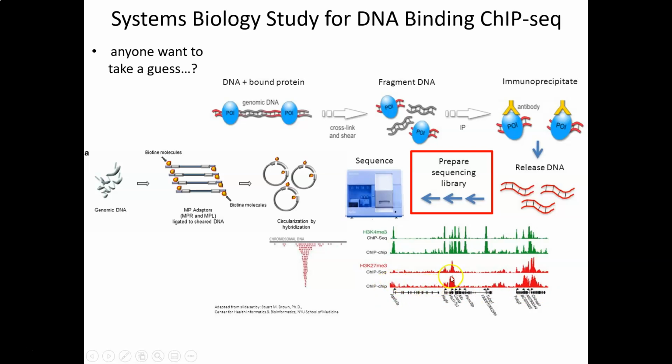And the size of these peaks represents how many of this same identical sequence we picked up in our sequencing reaction. That is indicative of lots and lots of protein binding with high efficiency. All of these shallow peaks here represent regions that our protein was bound to, but not at such a high level. So we see that our protein is bound in some intermediate way here at the end of the chromosome. It's really down to the level of probably statistical noise throughout the chromosome, but at the beginning of the next chromosome, we see lots of our protein binding, and then not too much, and then tons of protein binding on these chromosomes here.